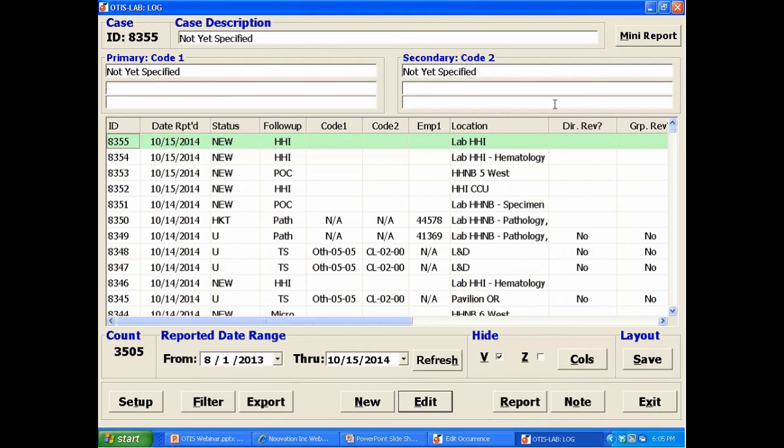So I've clicked over to OTIS Lab, and OTIS Lab is a little different from OTIS Blood Bank. It doesn't have some of the fields like the employee statement. We don't do that with every one of the OTIS labs. It doesn't have the BPD reminder, FDA codes, things like that. But it does have codes, we code every one of these, and the nice thing about OTIS is you can build your own codes, as I mentioned before, for each section or for something you want to track that comes up during the year. So it's very adaptable.